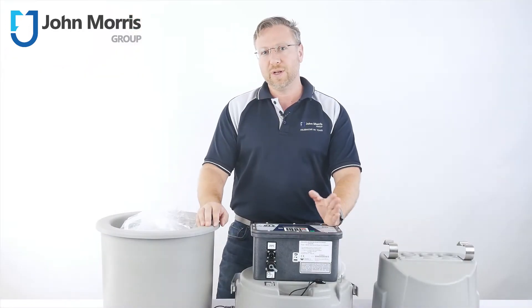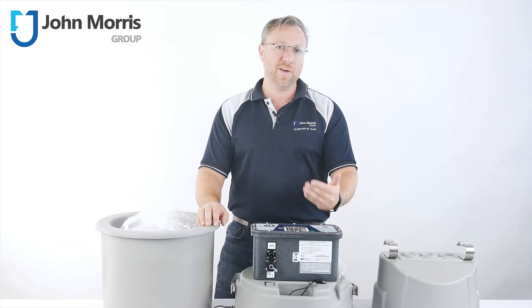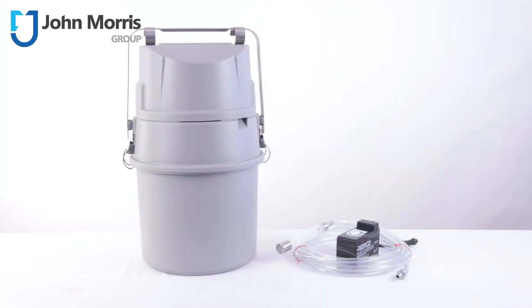Normally found in municipal or industrial locations, the GLS will collect samples on either a time or event basis. It easily fits down a manhole as small as 46cm and weighs just 12kg dry.